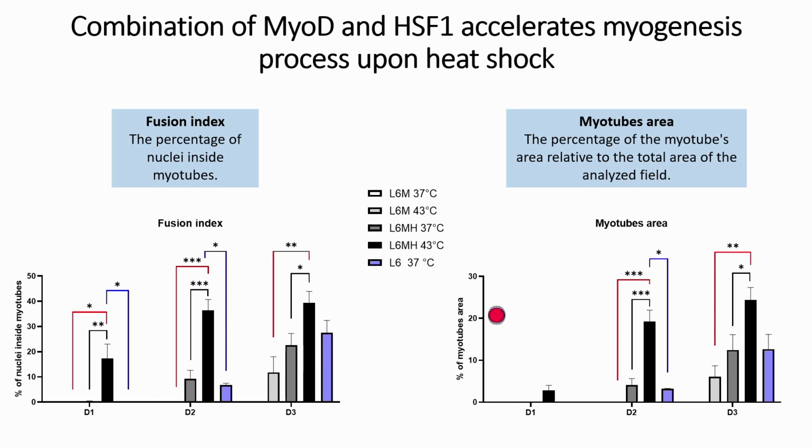And the same we can observe for the myotubes area, which is the area of the myotubes out of the total area of the analyzed field. And we saw an increase in the area starting from day 1, and a significant increase through the 3 days time course.